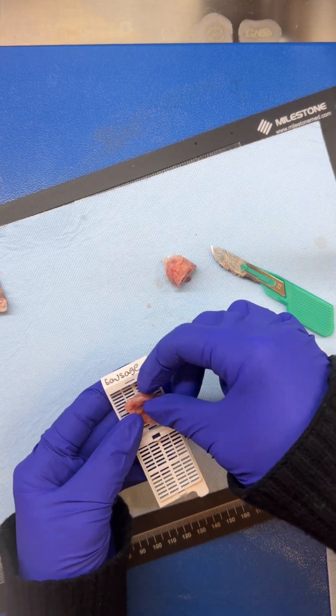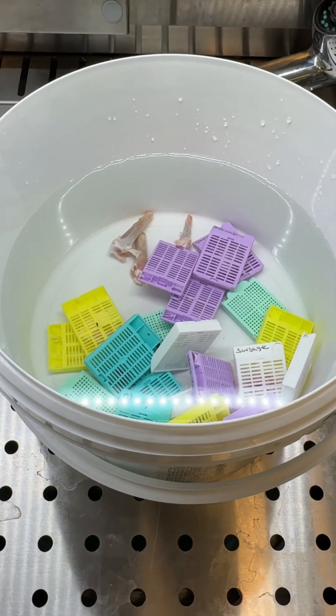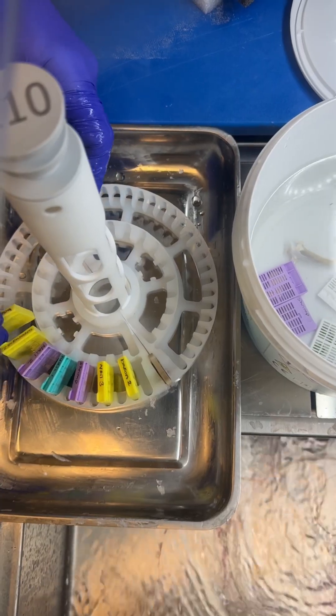The first step is grossing, which is cutting the specimen into small sections and placing in a cassette. Those cassettes now go in NBF to fix the sausage.